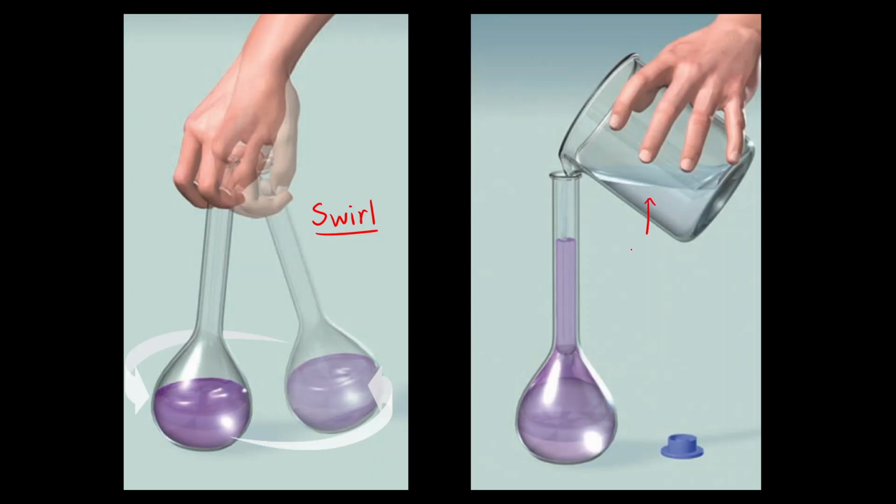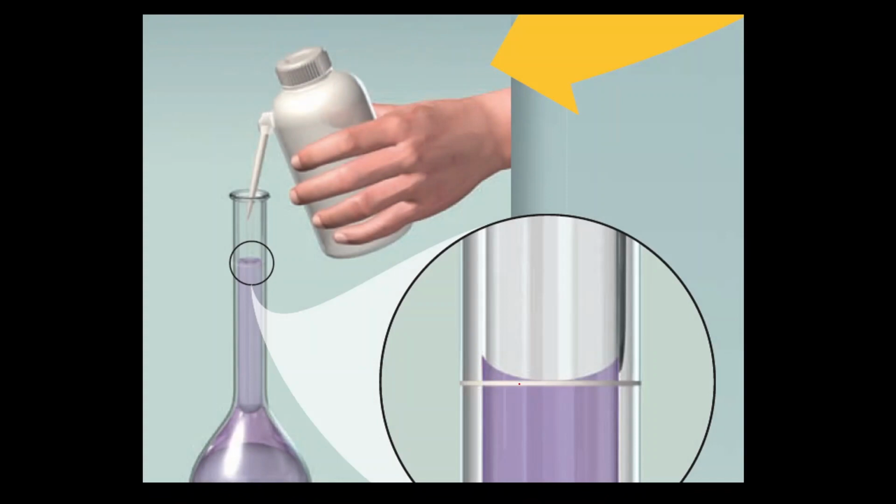We are adding the solvent, that is the water, up to the mark. There is a mark up to which we have to add. This is the mark that I was talking about. This white line you can see is the mark which is already provided on the volumetric flask. To add the last 1 or 2 drops, you can use this wash bottle, or a better piece of equipment would be a pipette. So in this way we can prepare our solution.